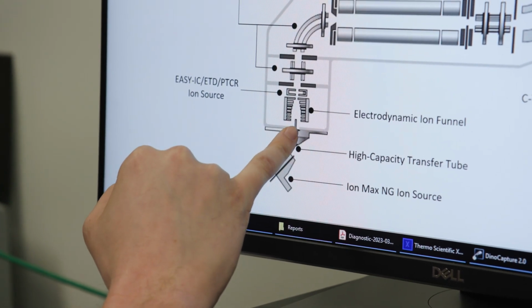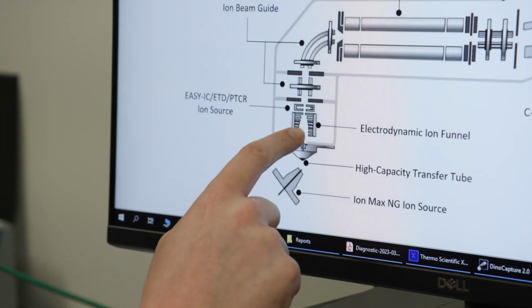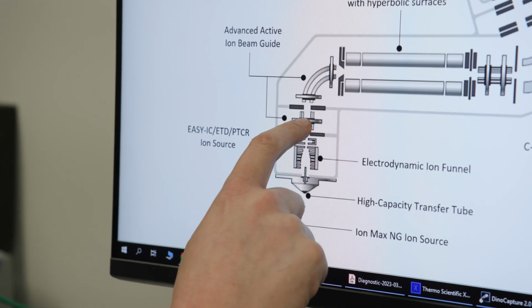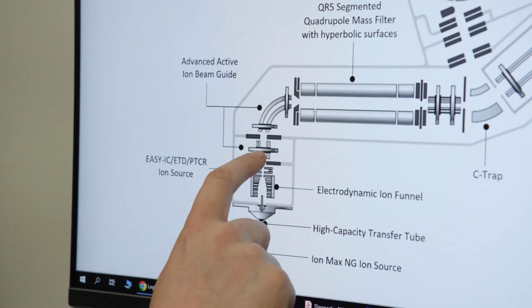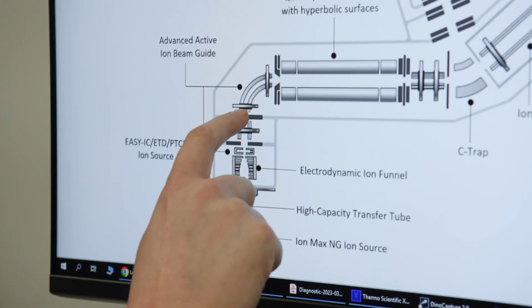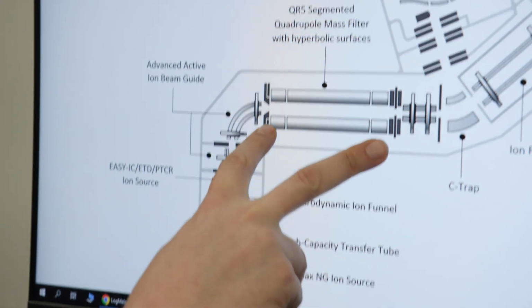And then our ions, we can pass them through here, which is an ion funnel. It focuses our ions. And if they're charged, we can apply electromagnetic voltages to manipulate them. So we have this bent flatapole here. If it's a neutral ion, it can't be manipulated with electrical fields, so it'll just hit the walls. But if it's charged, we can move it through here. And then this is our first mass spectrometer. What this allows us to do is filter for things that we want or don't want.